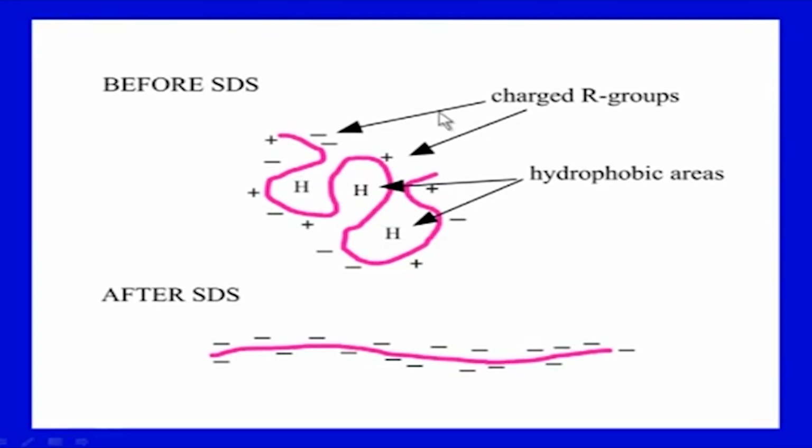As we were discussing, a protein is folded, it has interactions, hydrophobic areas, other charged groups, hydrogen bonding, all those things. Now, when you treat it with SDS, the protein is extended and it is overall covered by the negative charge. Many times these proteins have different shapes, but they are now extended molecules, and heating also helps in that.